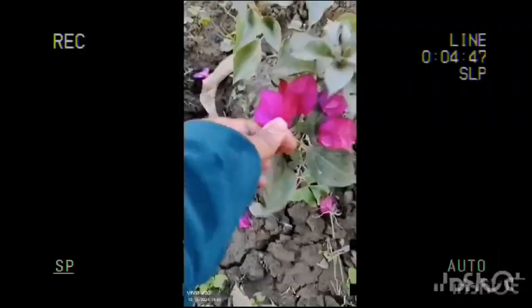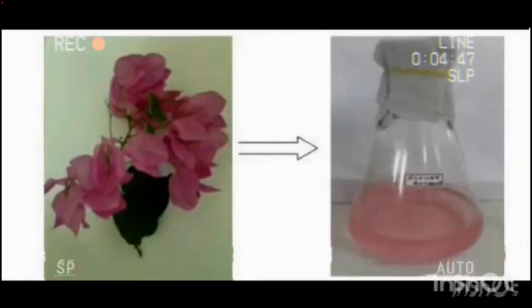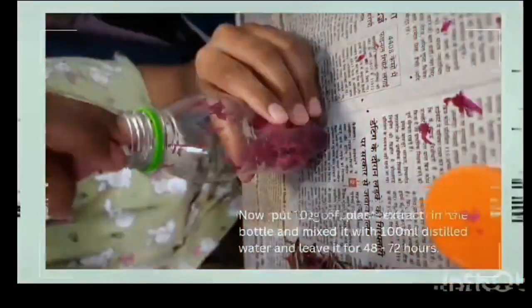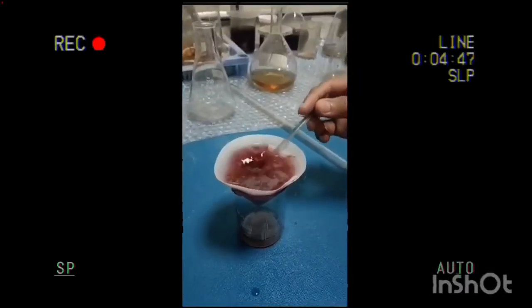For this experiment, first we took the bougainvillea leaves and chopped them into small pieces. Then the sample is prepared by soaking the leaves for 2-3 days. That is strained by filter paper. 0.746 g KCl in 1 liter distilled water is added to prepare 10 millimolar KCl solution.